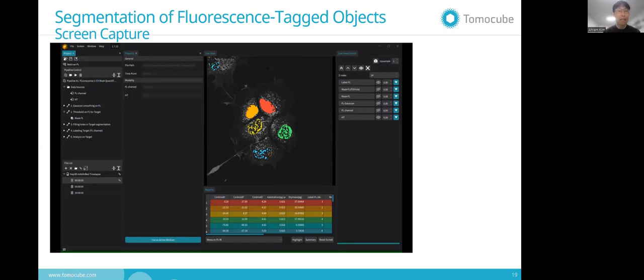So we need to fill them. I applied the fill hole process, but the holes are very sparse, so it couldn't cover the whole area except these two. In this case, you need to adjust the parameters to reflect this situation, so you may need to lower the value to include those excluded areas.